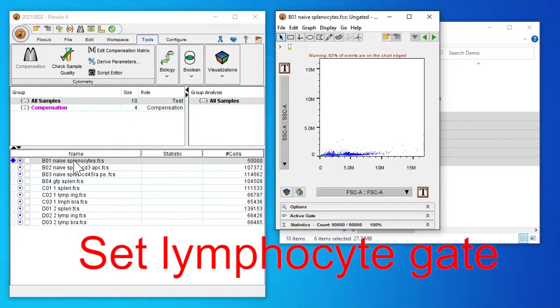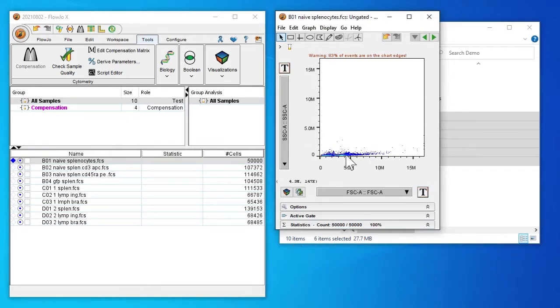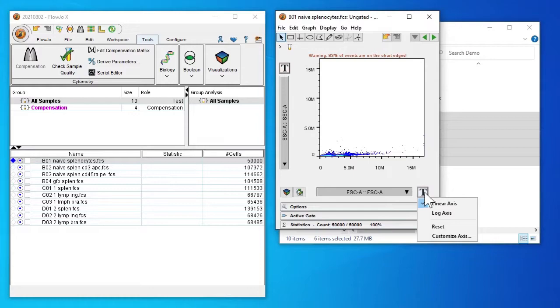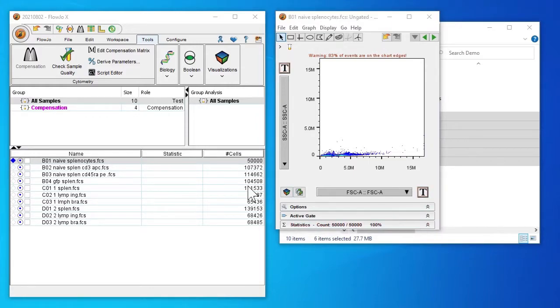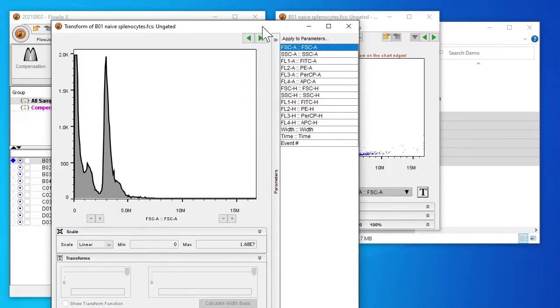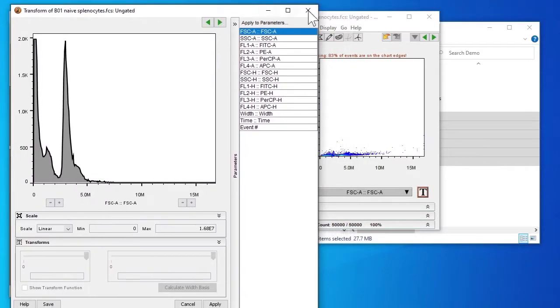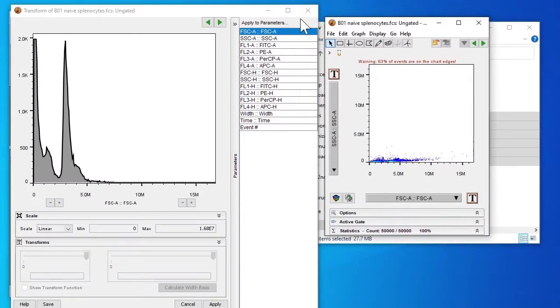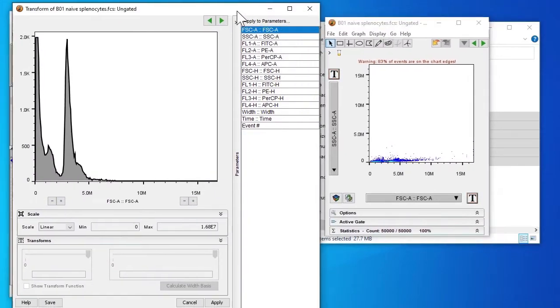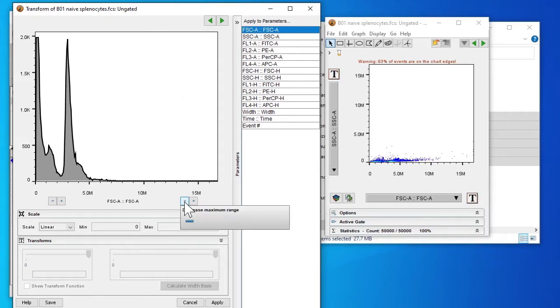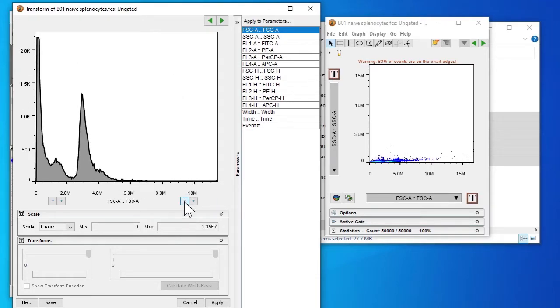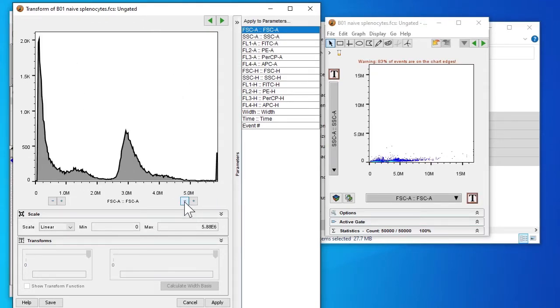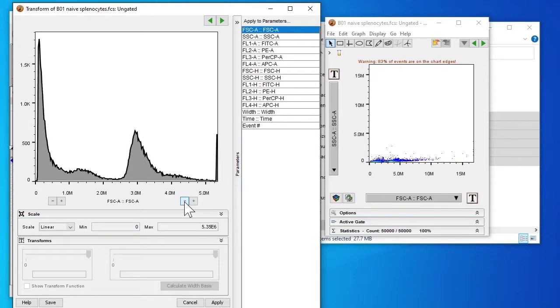Next we're going to set our lymphocyte gate. We're going to customize the x-axis and minimize it by using the minus button. Click apply.